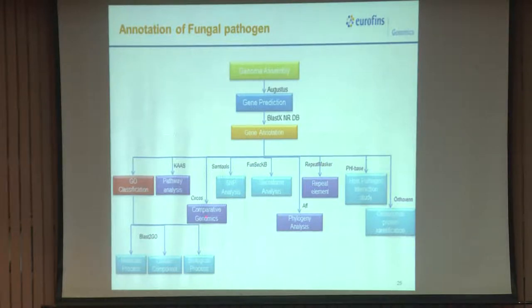We can do a comparative analysis, comparing two genomes together and identifying the sequence-wise differences between the genomes. We can identify the SNPs. We can do repeat identification. We can identify which types of repeats are there in the genome, what the different classifications of the repeats are, which classes of repeats are there, and what percentage of repeats are there.